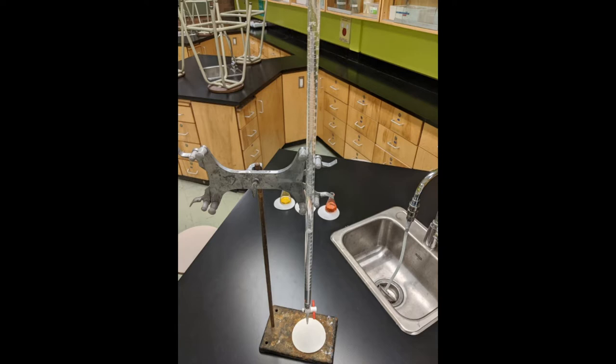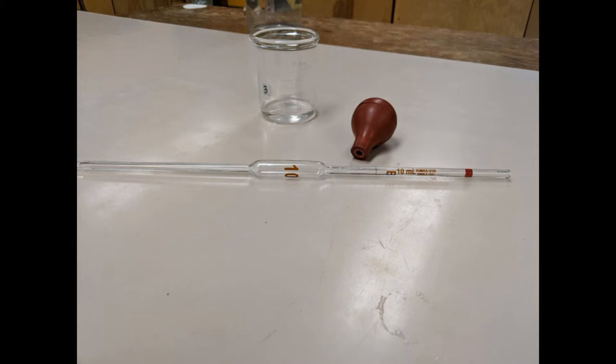Here's our setup for pipetting the sodium carbonate into our Erlenmeyer flask. We have three things: this beaker is containing the sodium carbonate we're going to use, this pipette is what we'll measure out the 10 milliliters with, and this bulb goes on the top. Just like when you suction anything up, you squeeze it and suction up the liquid.